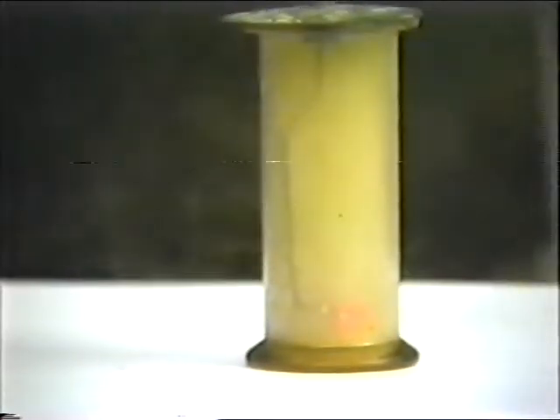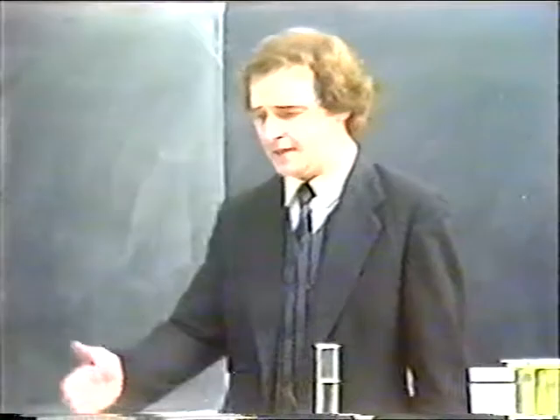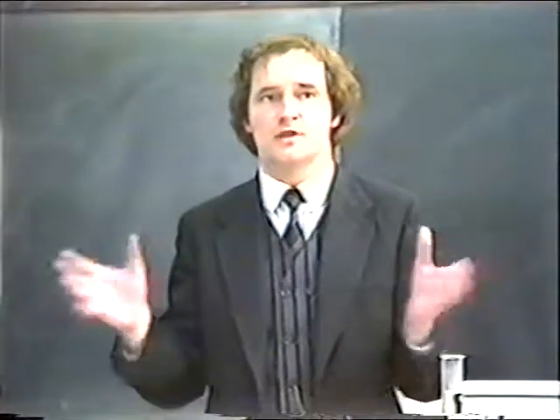In the reaction which we are observing here, I am combining two elements which are extremely poisonous and dangerous to life of any kind. The two elements which I have combined are sodium metal and chlorine. And the result of the reaction is the compound sodium chloride. Now this reaction is particularly interesting because we have combined two poisons to make a substance that is not only not poisonous, but indeed it is necessary for life.